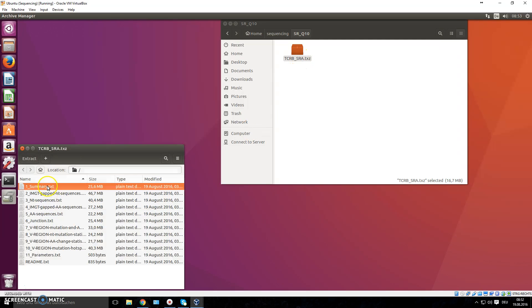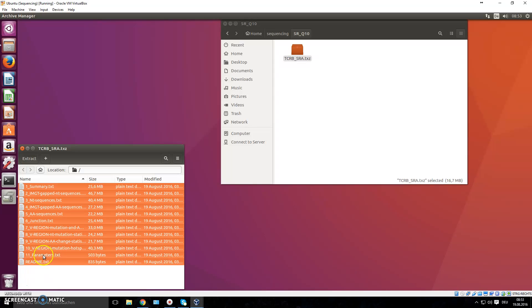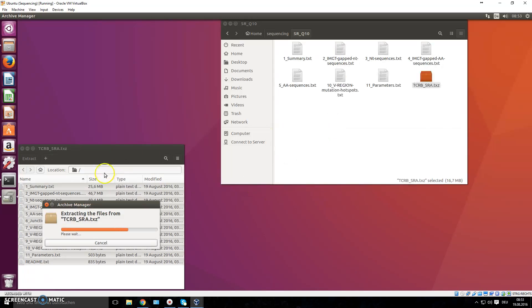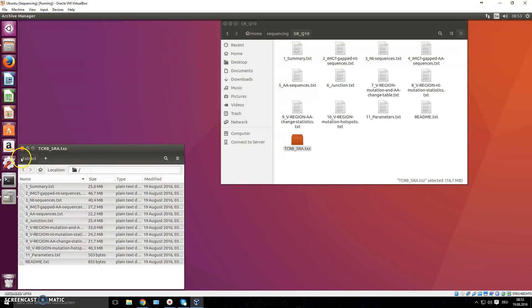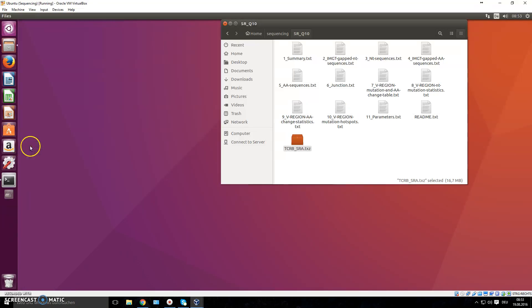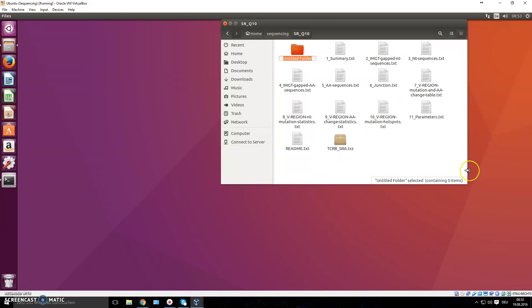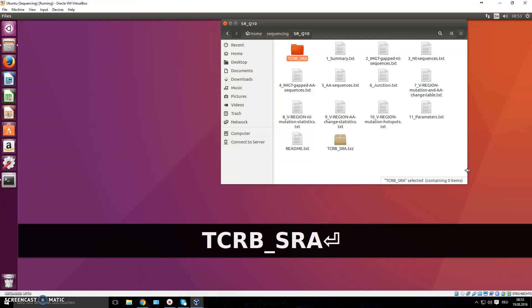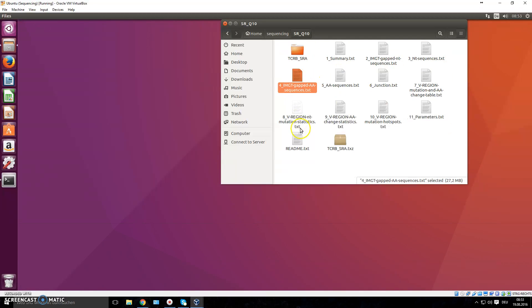Dragging and dropping is okay if you're just looking at one file, but if you want to automate things, I don't recommend this. As you can see, it now has all these different files. Let's actually make a folder for this, call it 'tcrb_sra', and put this specific sequence in there.